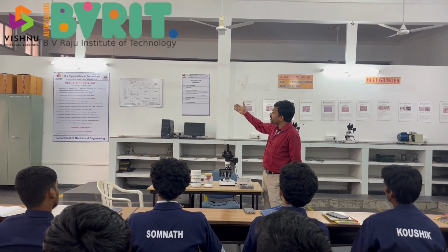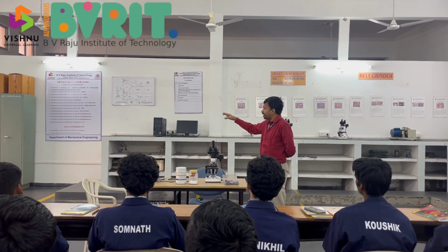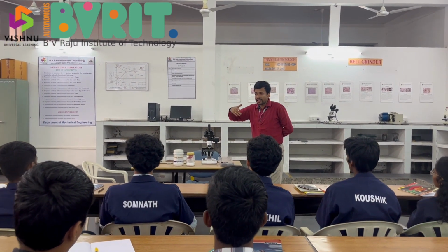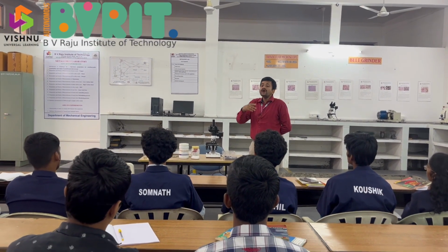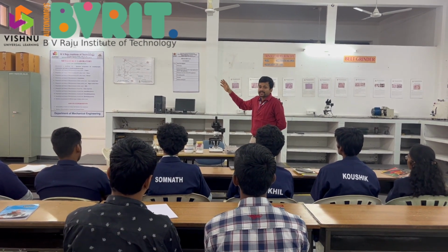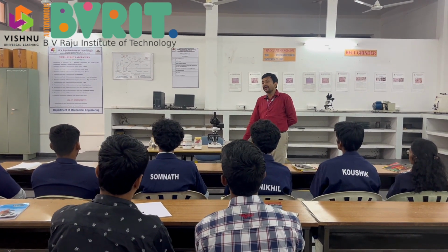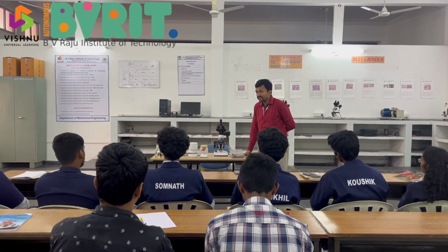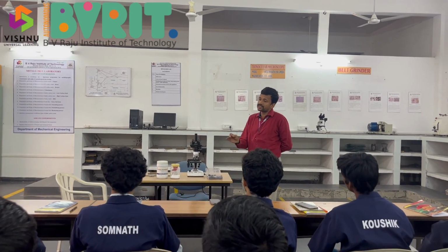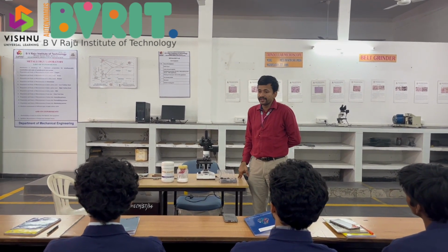Next is about the preparation and study of microstructure, first category, which is pure metal. So you can take any pure metal. We are considering copper, or if you are given something like pure iron, we can consider. So for the time being, we are considering some of the pure metals like copper. Then we have a copper alloy, which is brass, and another copper alloy, which is bronze. So first experiment is on the pure metal, second experiment is a copper alloy, third experiment is also on a copper alloy. Then we have the preparation and microstructure of aluminium.